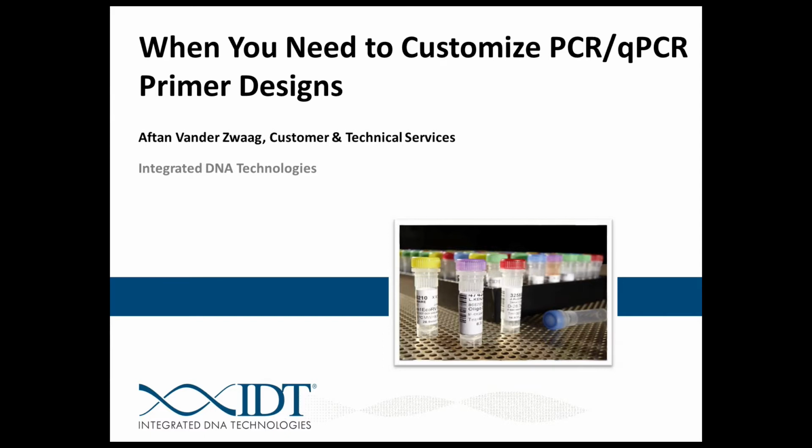Today we'll be discussing situations in which you need to customize PCR or qPCR primer designs. I will give some live demonstrations regarding these customization scenarios as well. We'll spend a lot of time discussing the recently redesigned and revamped PrimerQuest tool to provide even better designs for PCR, qPCR, sequencing, and other customized design applications.